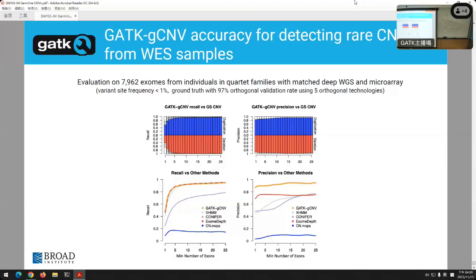My second question is whether the CNV state of the reference genome is important to identify the CNV state of the samples that map to that reference genome. So if there are duplicated regions in the reference, how would that impact it?